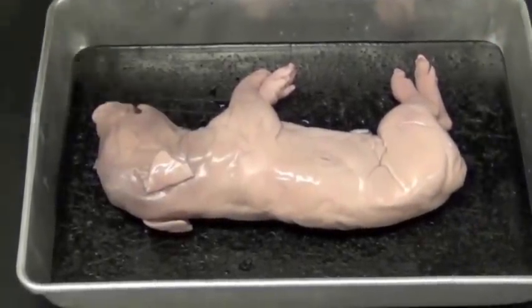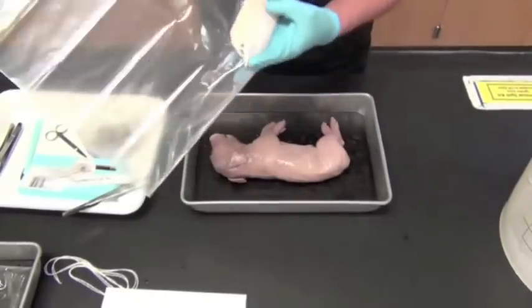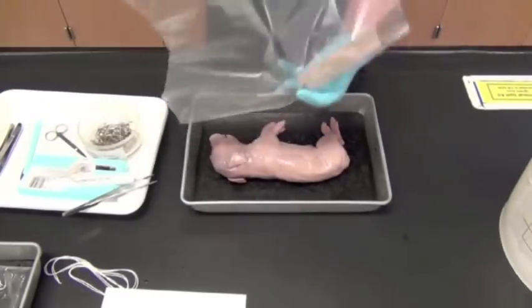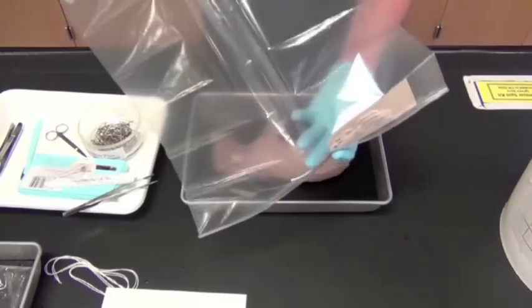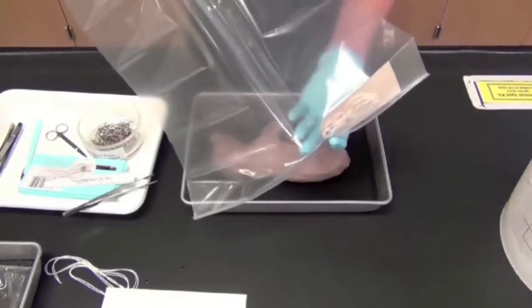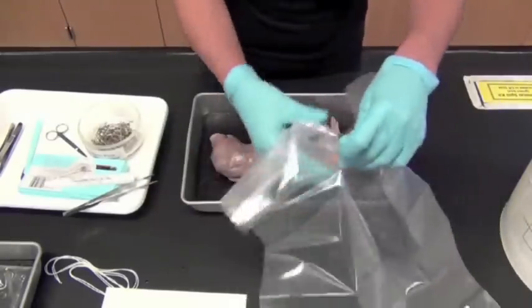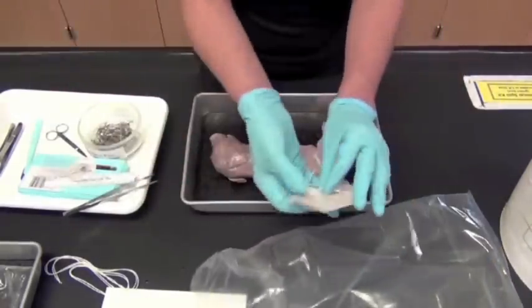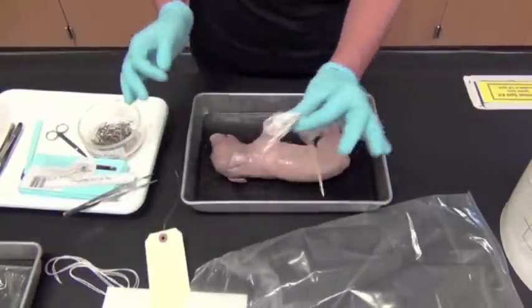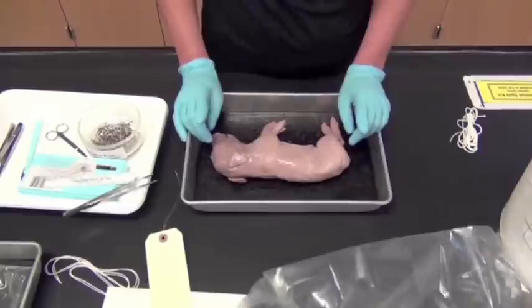Once you've placed your pig on the tray, don't tie it up just yet. Each pair of partners gets a bag with a tag and strings — do not throw away the bag, the tag, or the strings at any time, because the prep lab will not give you more. Open the bag, set the tag aside, and keep the strings ready for later.